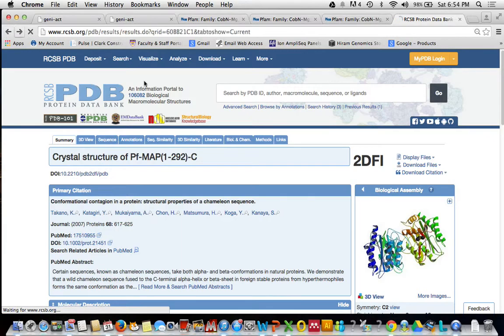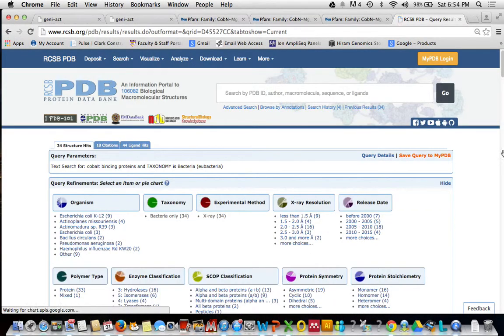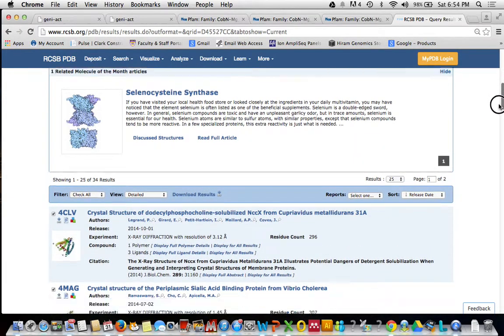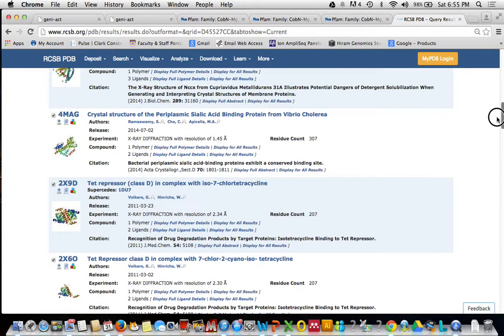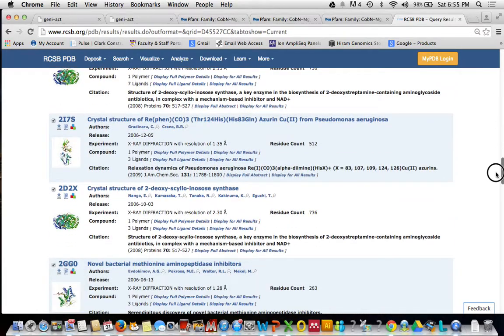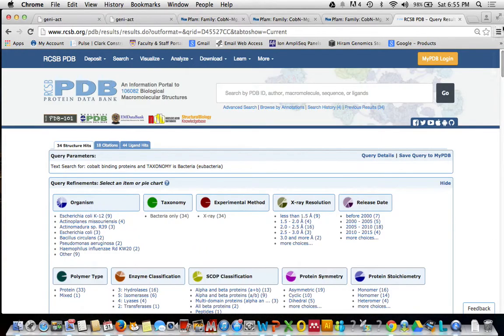So let's go back, look at bacteria. Okay. Yeah, this takes a bit of trial and error.